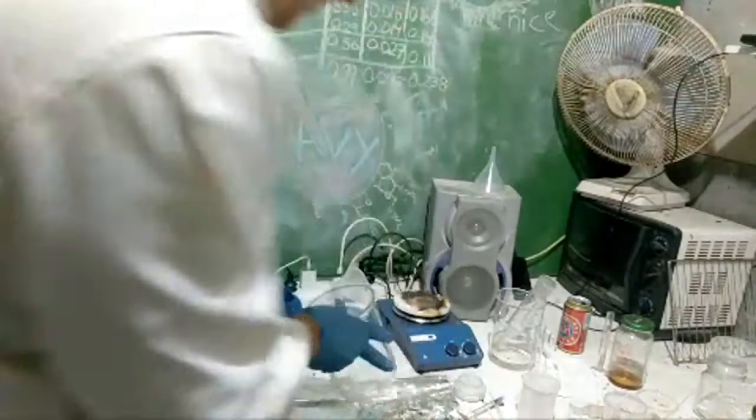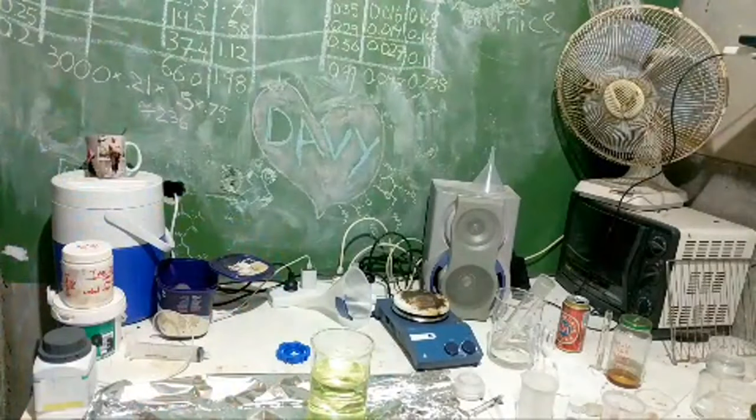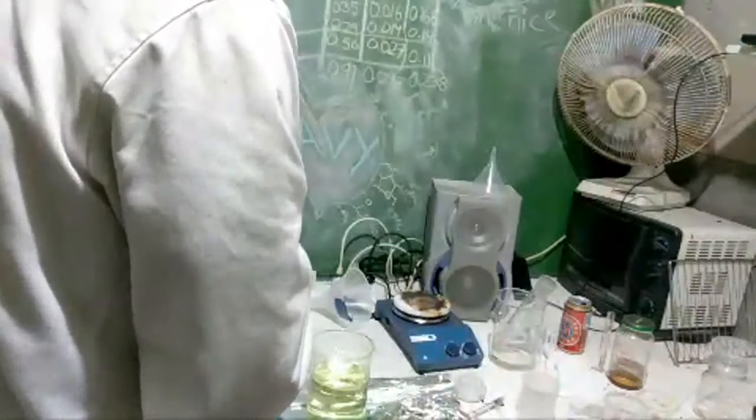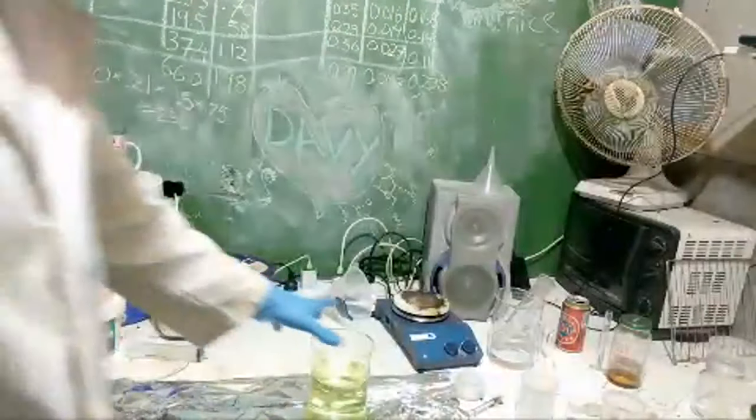Looked it up online and it seems iron 3 hydroxide should work. Alright. Pretty yellow. Can't be that weak if it's looking that yellow. That's cool. That's good. Now, as far as I'm aware, we'll probably have to add a lot of base to this, right?